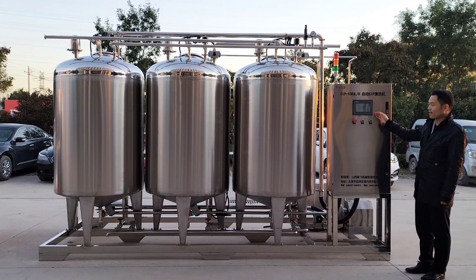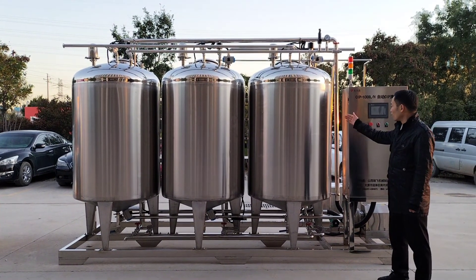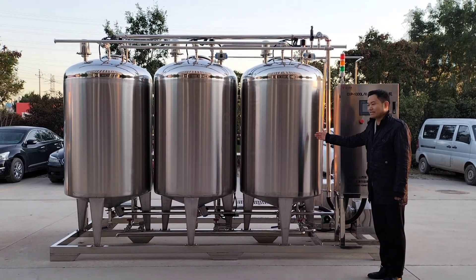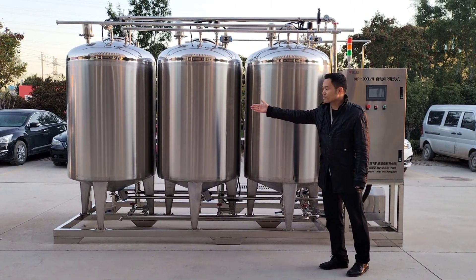It is automaticized. Here we can see one, two, three tanks. One is acid liquid tank, alkaline liquid tank, and water tank.